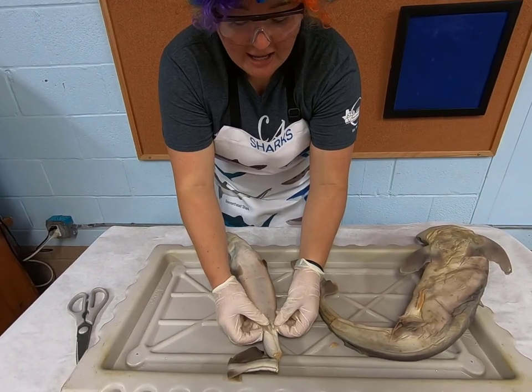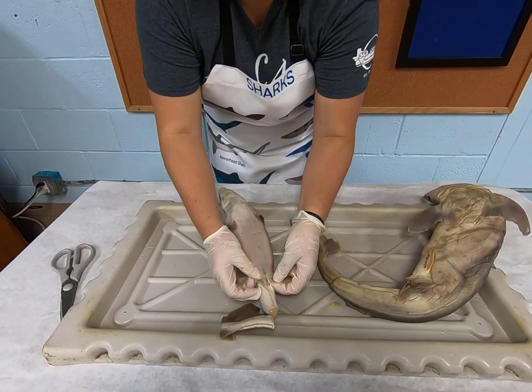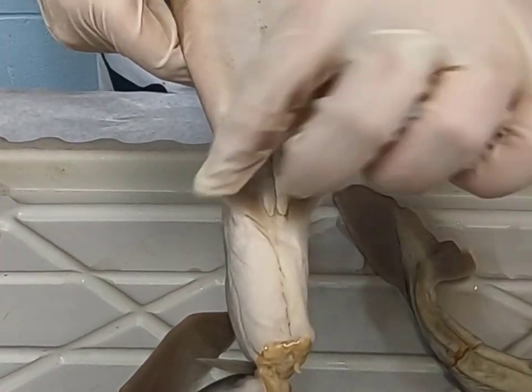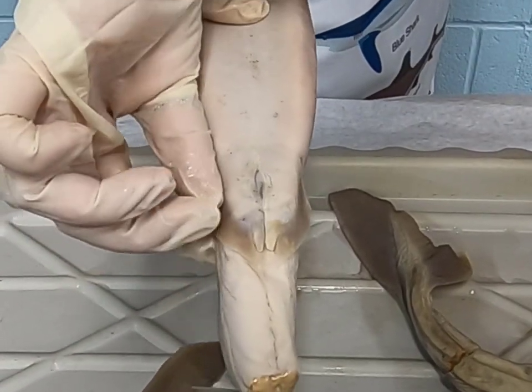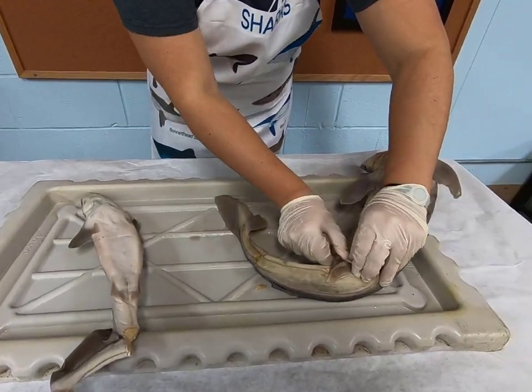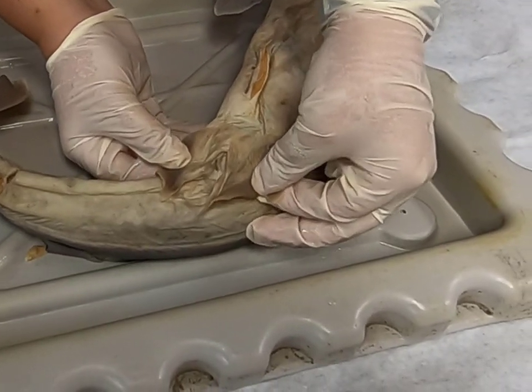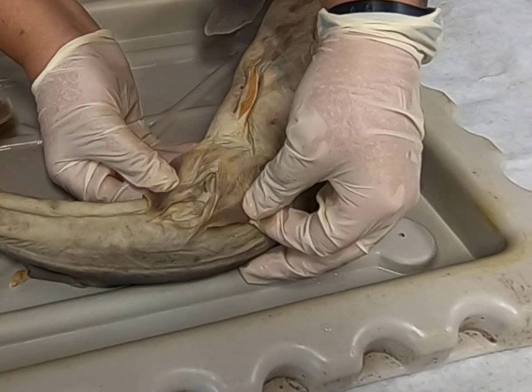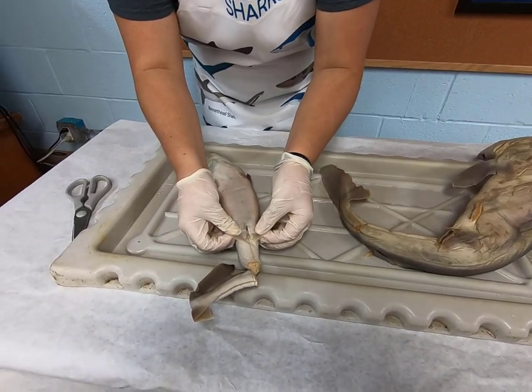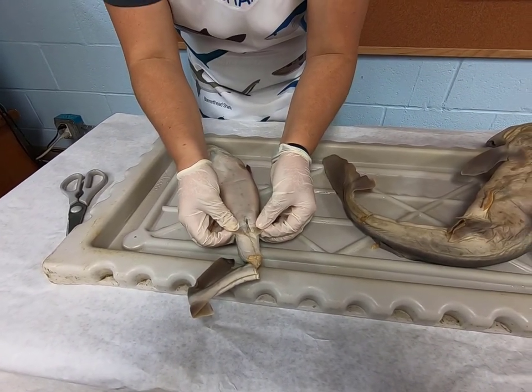Our boy shark has two finger-like projections. These two claspers, right here you guys can see, are to aid in reproduction. But only the boys will have these two claspers. The females, if you look again, they don't have those two finger-like projections. They don't have those claspers. So that's how you tell the difference externally from a male and a female shark.